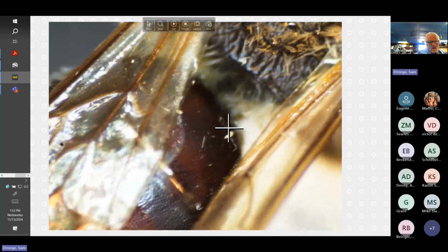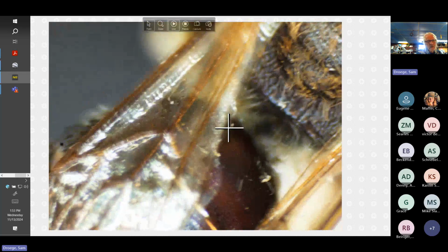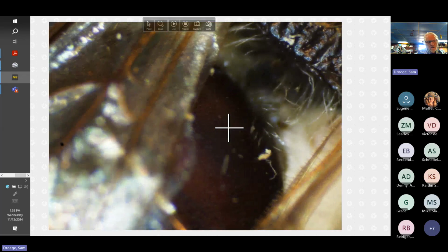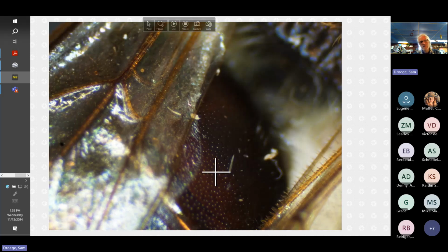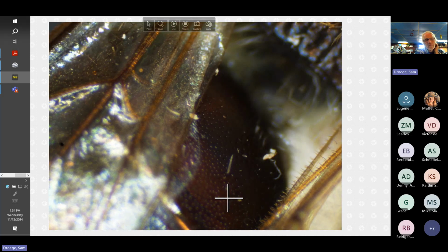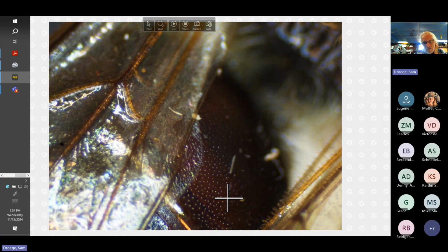All right, so again, similar to one of the other species that we were looking at, maybe rehni, you could say, okay, well, that's pretty dense there. I'm going to change the lighting. No, that's good. So you can say pretty dense. Well, in comparison to something that has just pits here and there, true. But when we look at the spacing, almost basically none of them are touching one another.